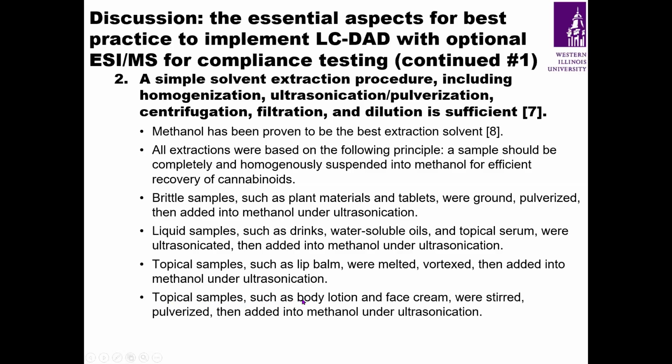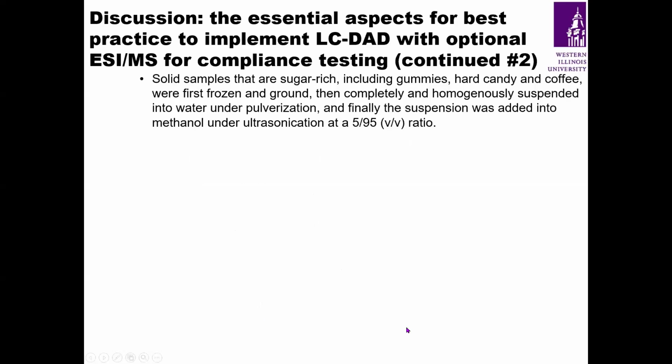Topical samples such as body lotion and face cream were stirred, pulverized, and added to methanol under ultrasonication. Now, solid samples that are sugar-rich, those are special, including gummies, hard candy, and coffee.